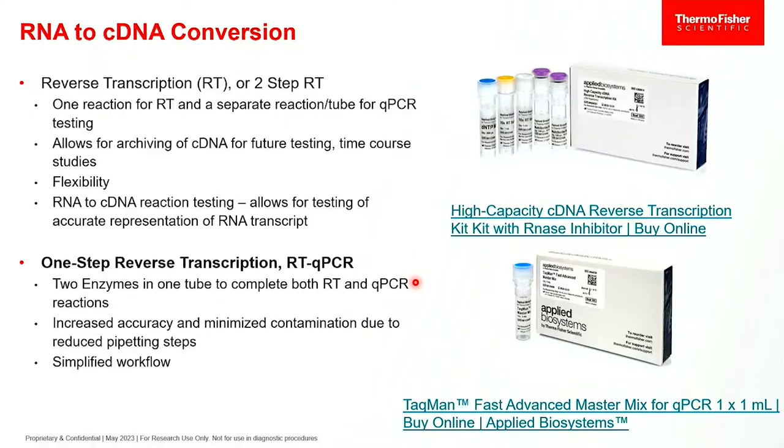Okay, so when you do the RT reaction, this reverse transcription mix will have all of the components to do the copying. It has the enzyme, it has the material to do that. In addition, you have all the other components. So if you're doing a one-step, everything sits in one pot, and we separate those actions based on temperature. You do the RT step at 50 degrees.